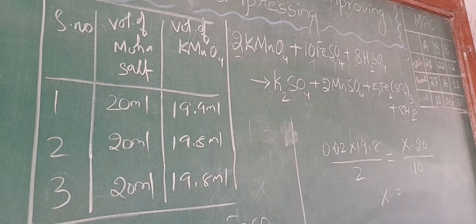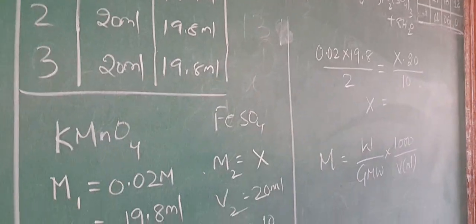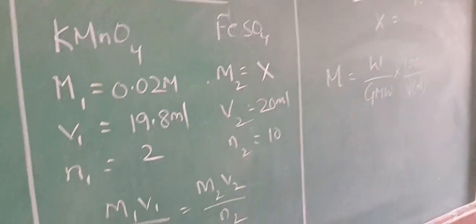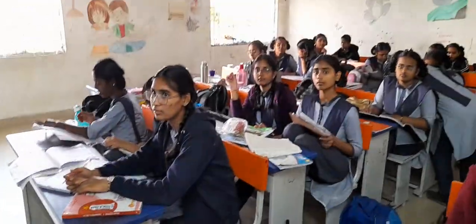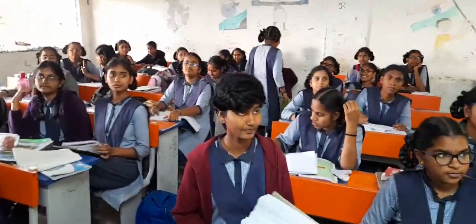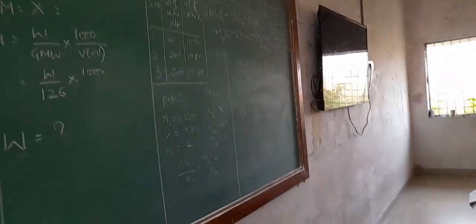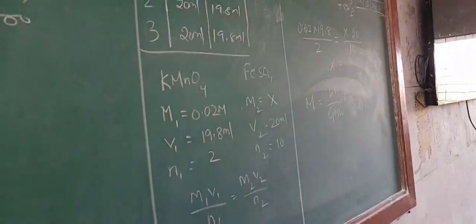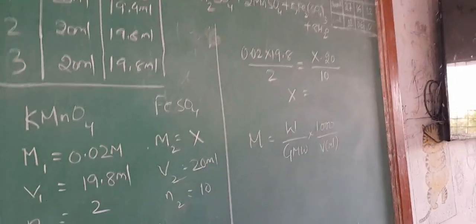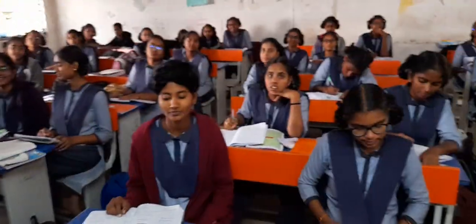After completion of the practical, we need to note down the readings like this one, and we should go with the calculation like this. Children, are you all ready with your set of readings? Yes. So as explained, the same thing, Nana, in the same formula as explained on the board, you substitute your values and tell me the answer. Okay? Is it okay?